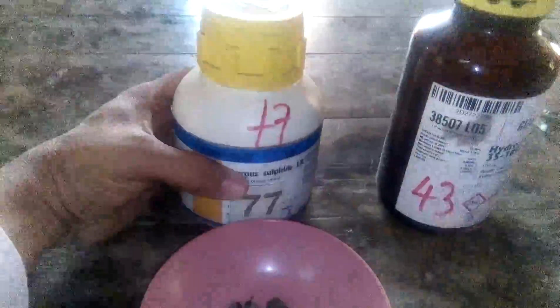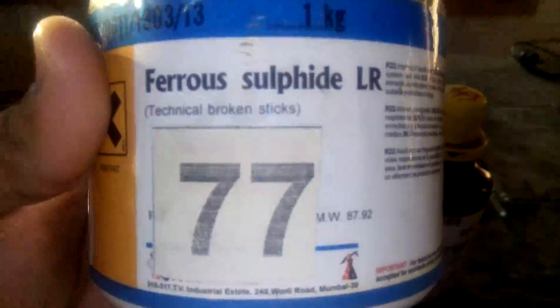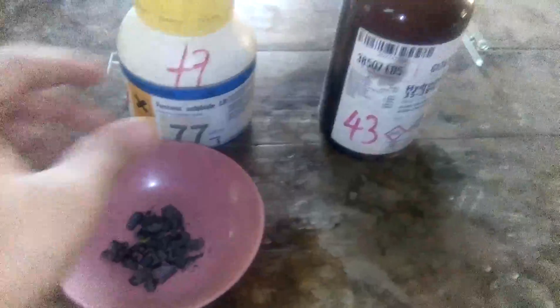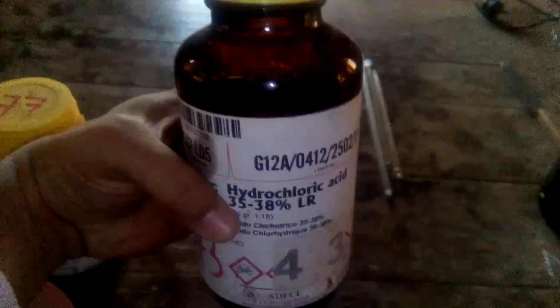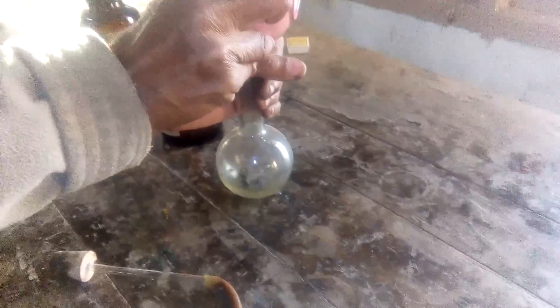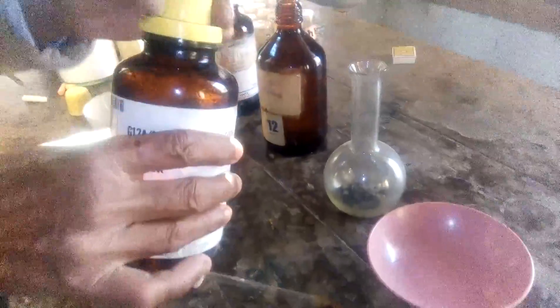In the laboratory, first of all, this is the ferrous sulfide, FeS — this is the formula and this is ferrous sulfide. Now this ferrous sulfide is reacted with concentrated hydrochloric acid in the round bottom flask. Now add some hydrochloric acid.